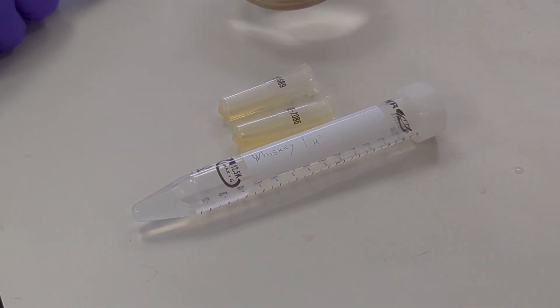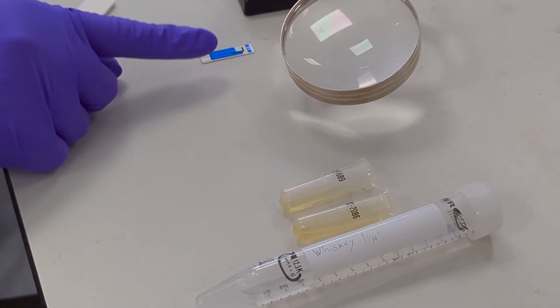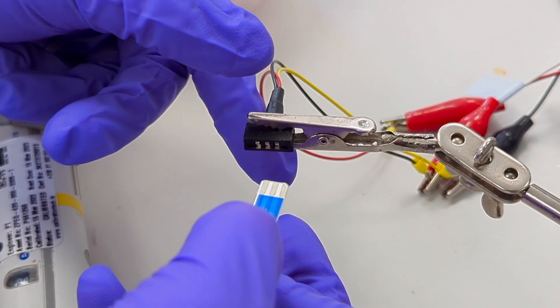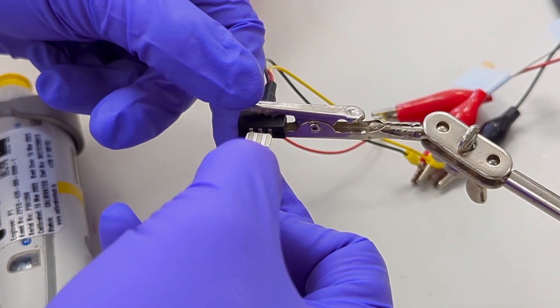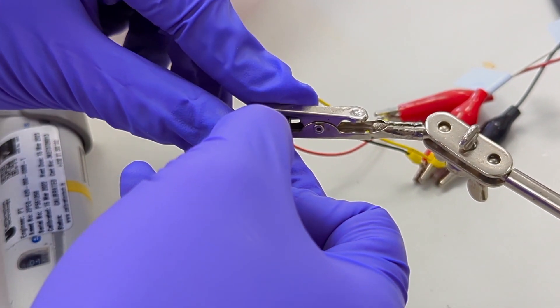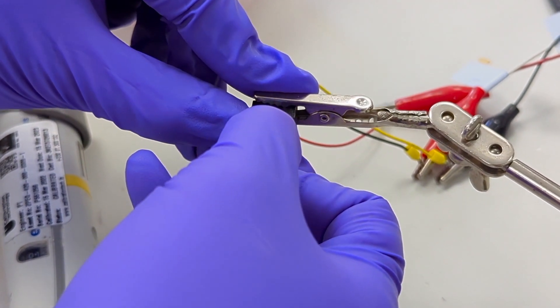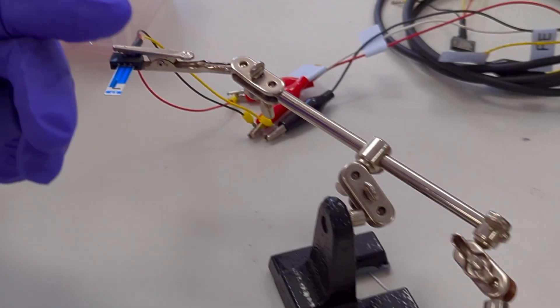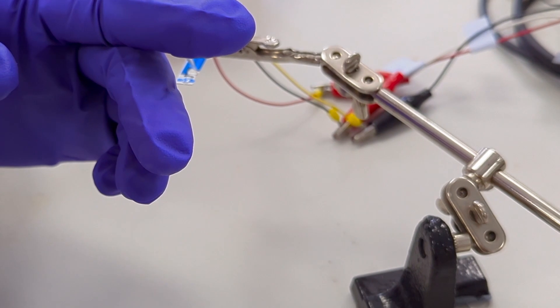We will be using our SPCE sensors to test the whiskey. Now I'll insert the sensor into the connector, making sure that the contacts are correctly aligned. Now I'm going to wet the sensor surface with a buffer to allow the sensor to stabilize.